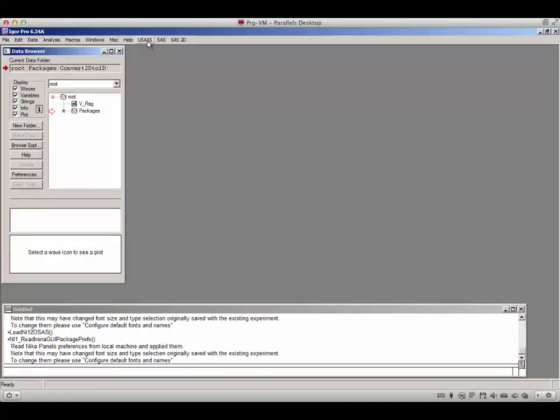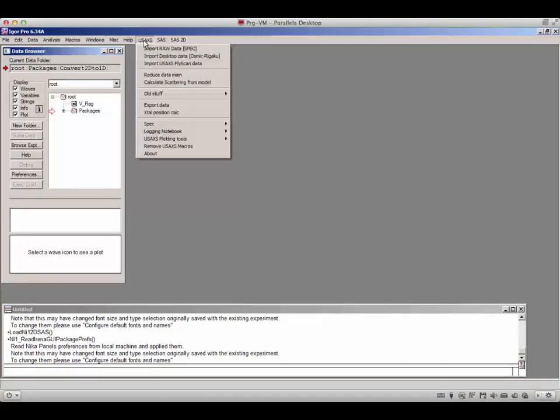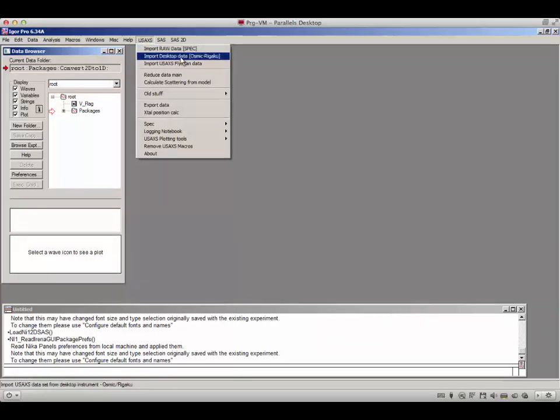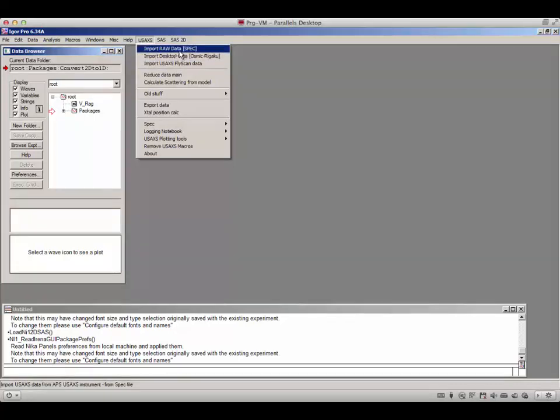You always want to start with the Bonse-Hart step scanning USAXS. USAXS data are absolutely calibrated — the intensity is on absolute scale. They span the largest range of intensities and Q vectors, so they are considered the baseline of the instrument. You have a choice: you can import raw data, which would be the spec file from step scanning, or you can use another tool to import fly scan data. We will walk through both.